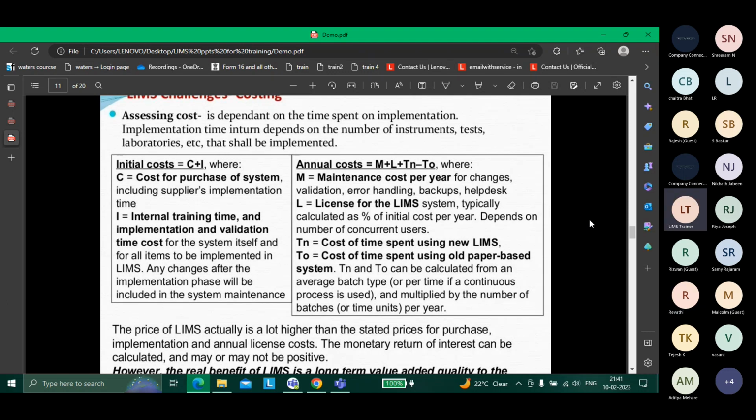But if you go from the bottom, first you understand the sample, first you understand the analysis component, then you slowly go to product. I'm not talking theoretically, I'm talking about lab values, how the product is built, because product has, inside, again, product table, product grade stage, product spec. There are 4 tables, parent table, then child table, again child table of that table. So we'll come to that later.